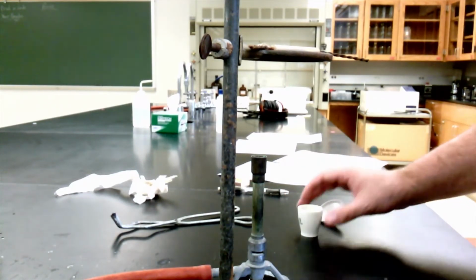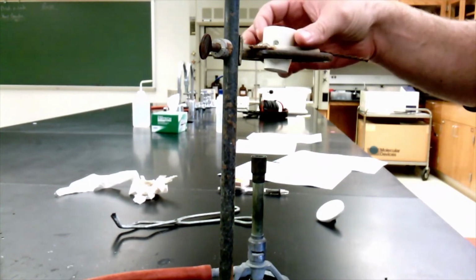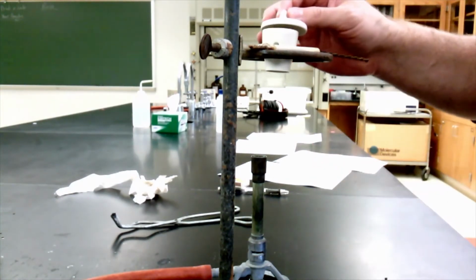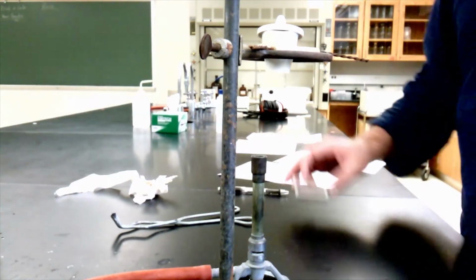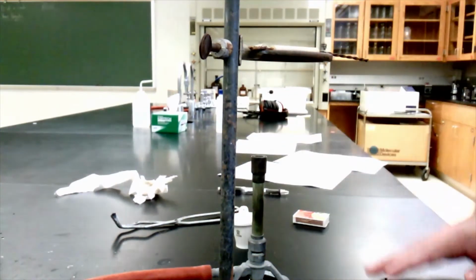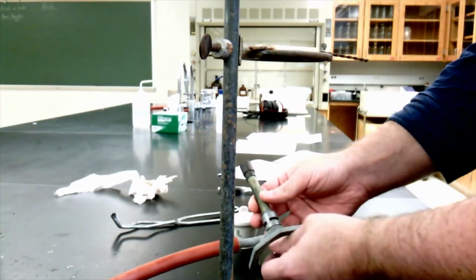Okay, but for starters, I need to make sure that I can get the mass of this crucible really reliably. And right now it might be a little bit wet. There's water everywhere, especially when it's kind of humid, still sort of end of the summertime weather in Indiana. So we need to first drive all the water off of our crucible. To do that, we're going to heat it with nothing in it. We're going to heat it really strongly for a few minutes until we feel pretty good about the fact that it's nice and dry.